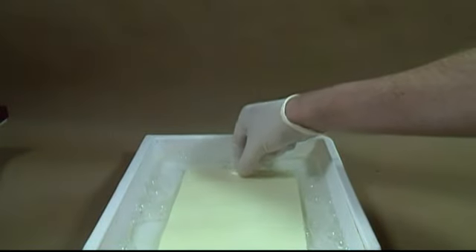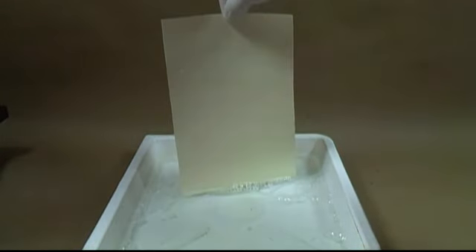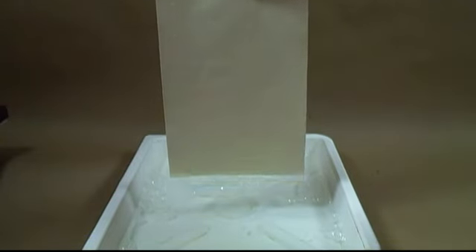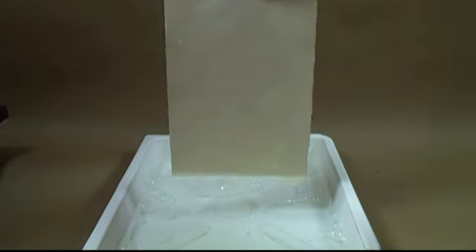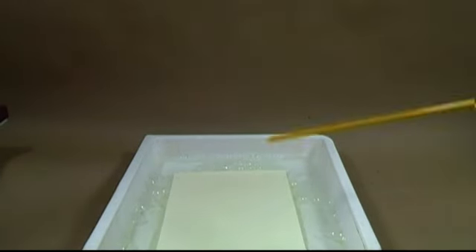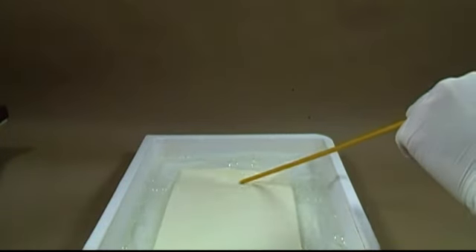After 10 minutes of soaking, remove the sheet of paper and hang it up to dry or set it on some paper towels to dry. Then add another sheet of paper. Run through the first bath however many pieces of paper you wish to sensitize. The next step will need to be done in the dark, so be sure to have your paper in an easily accessible place.